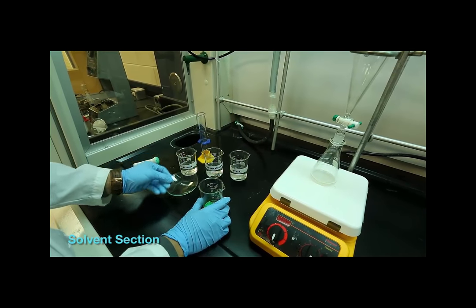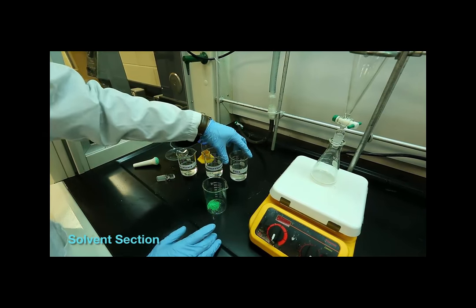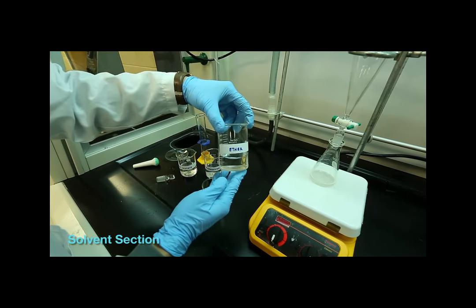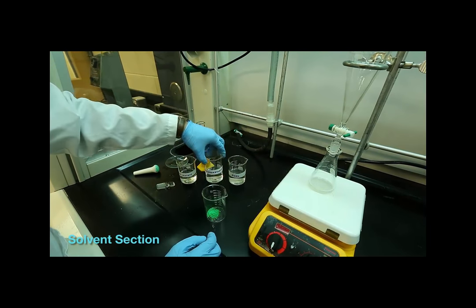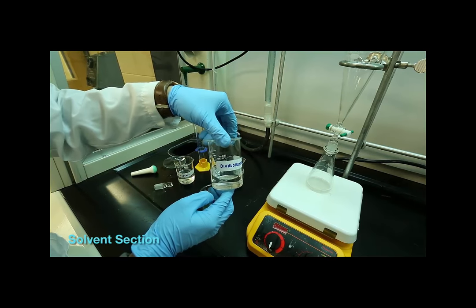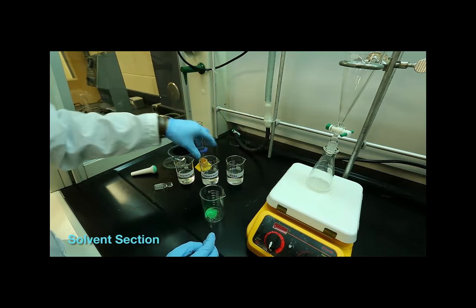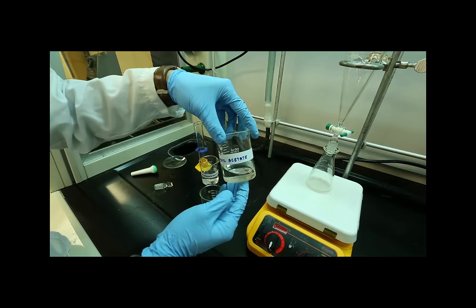Choose a solvent that has a high solubility with your desired organic product. In regards to selecting solvents, density is not an important basis of selecting a solvent. We will dissolve both in ethyl acetate.